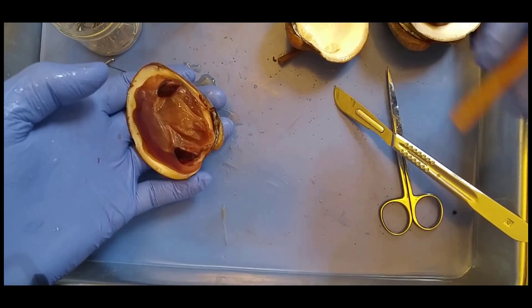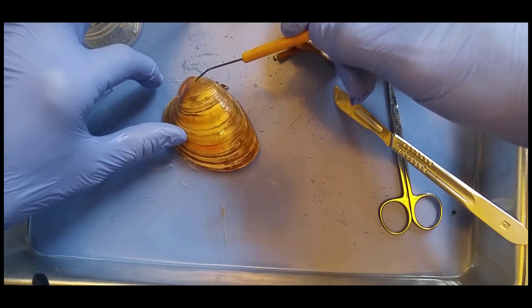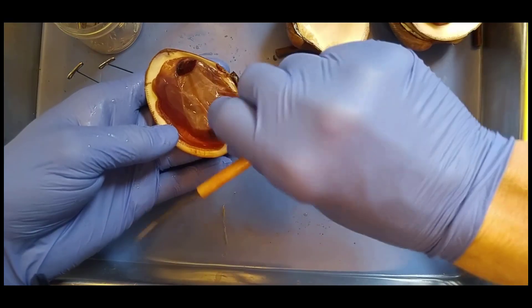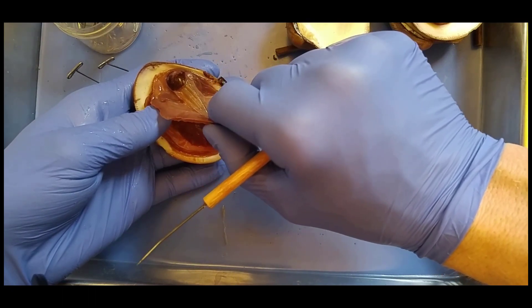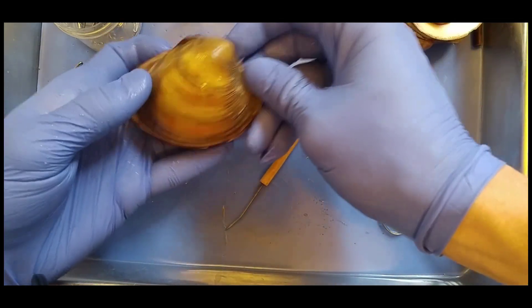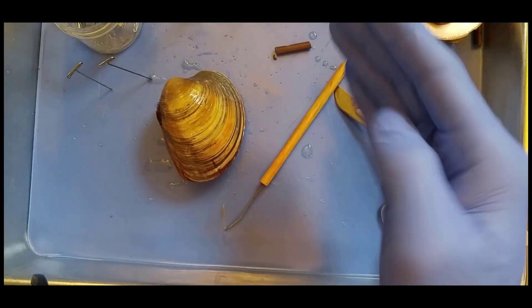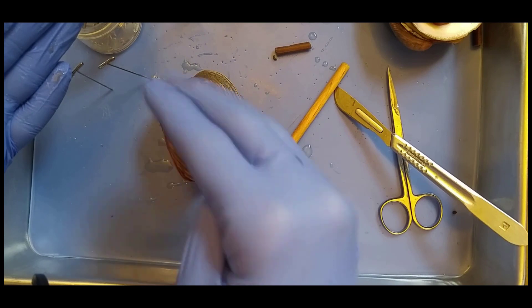Do you remember what this part of the shell is called? Umbo. Oldest part of the shell. So what we have here is a thin membrane tissue called the mantle, and the mantle secretes the shell. What does the mantle do? Secretes the shell. Makes the shell. These are organisms that are bilateral, and they live kind of like this. So we have the visceral mass, and then we're going to have gills, and then we're going to have mantle, and then we're going to have shell. So we're removing the shell, then we'll remove the mantle, and then the gills, and then we'll look at the visceral mass.